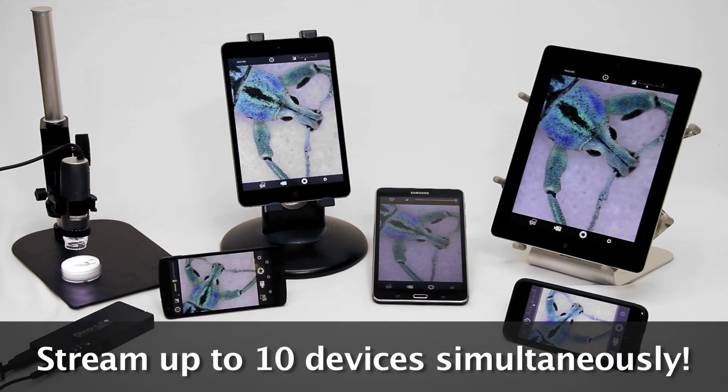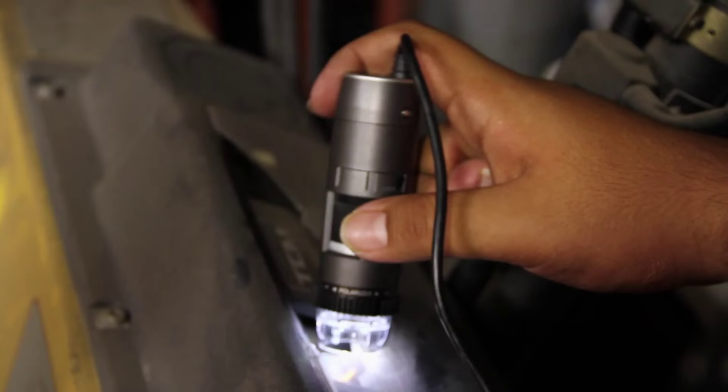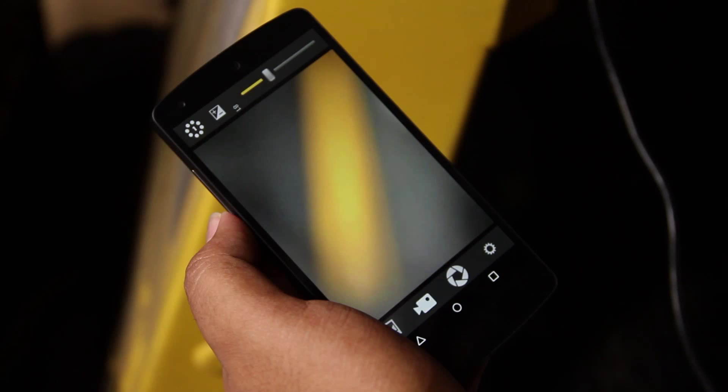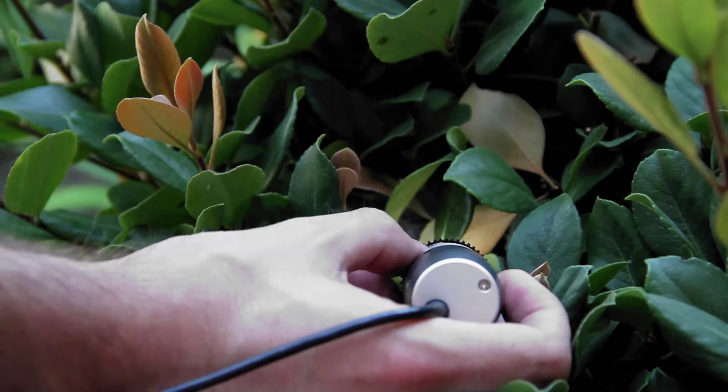The WF10 with the Dynoconnect app provides the ability to share wirelessly with a group within 50 feet, as well as the ability to use DinoLite to inspect objects while away from a computer or out in the field without sacrificing quality results.